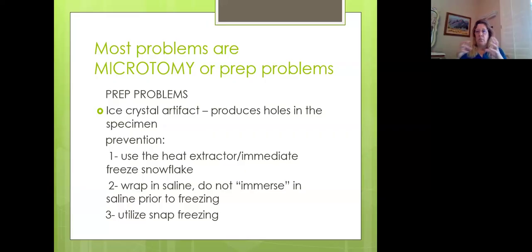And we prefer to not put that, or maybe it's a lung tissue that's suspected for tuberculosis. We prefer to not freeze that specimen and do a frozen section on it. So the pathologist will make that call. And if that's the case, he'll call back into the OR and say, I'm going to have to defer this to perm, meaning he's going to defer the frozen to a permanent section.